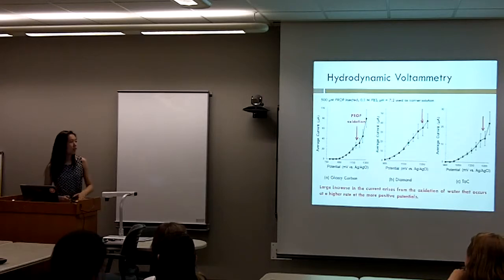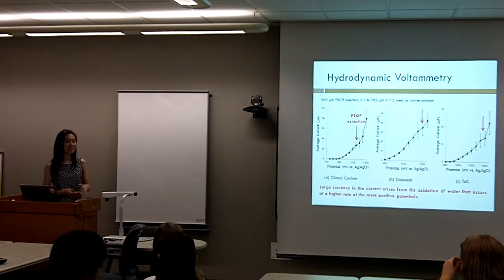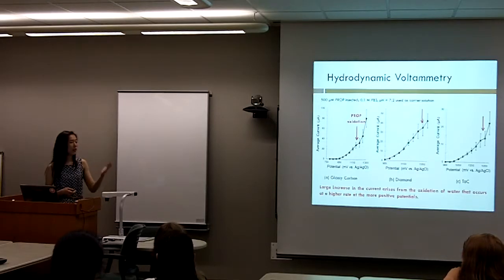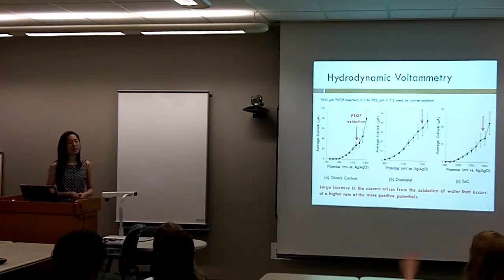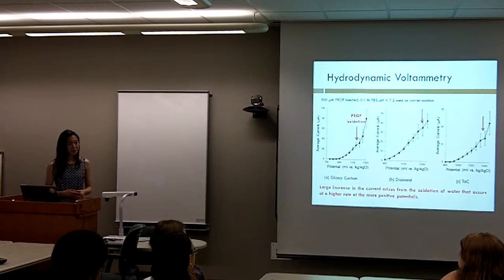Yeah, it seems a little bit larger. It's where you can best see the current starting to plateau a little bit, and when you look at the slope and how much it is decreasing in relation to the background current, you just take a value. Okay, yeah, that makes sense. Thank you.